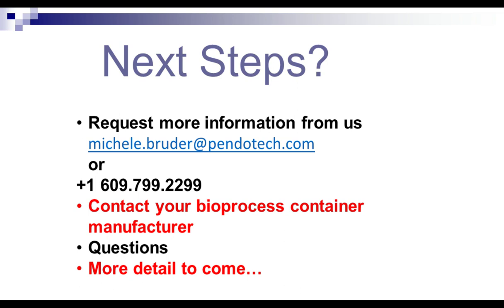The hesitation there is that the sensor, when it's in line in the loop, sometimes moves, and if it moves, then it's not always the same reading every single time.